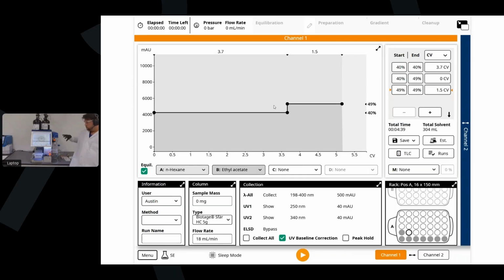So as it goes through there, it's going to get vaporized into very small particles. Those particles are going to be dried, and then those particles are what is actually scattering the light from the detector. And we see that detection, we can see the sample. So all of that's handled automatically.